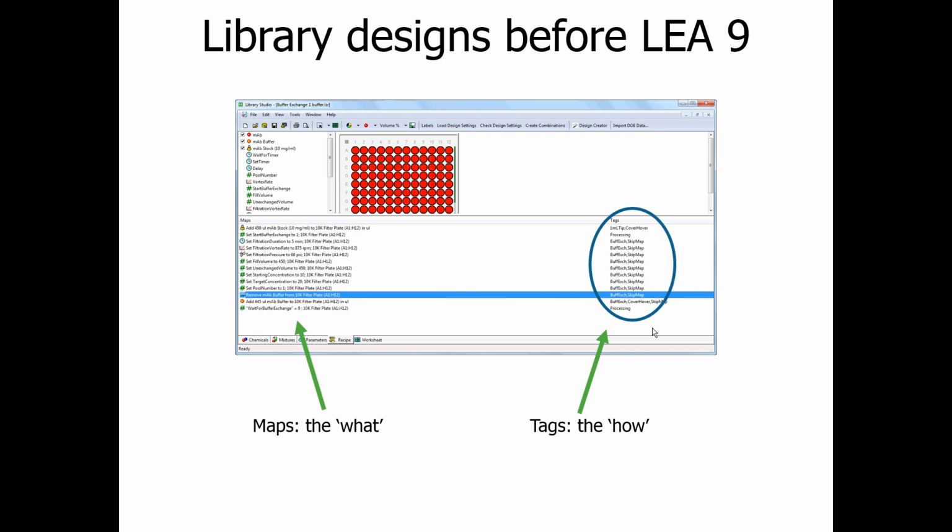It means that oftentimes people who are just learning on the system have a lot of challenges in coming up to speed quickly. The other element of this is that another user in your lab cannot easily and quickly identify what's happening in your experiment because they may not be familiar with the tags. The third element is that the tags could be typed in error, and if you made a mistake in typing the tag, you would not notice this until you got to the actual part where you're ready to run the experiment. So we found that it was creating an extra set of challenges for our end users running with the tags, so we wanted to create an alternate way to do this.